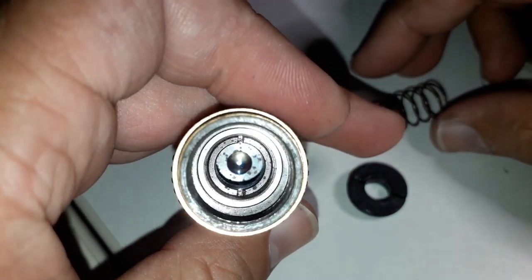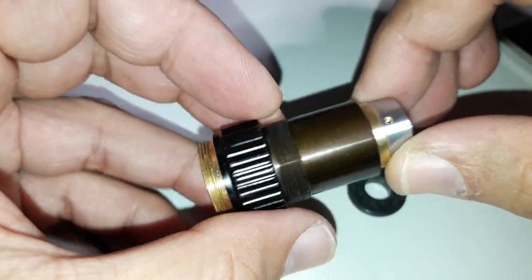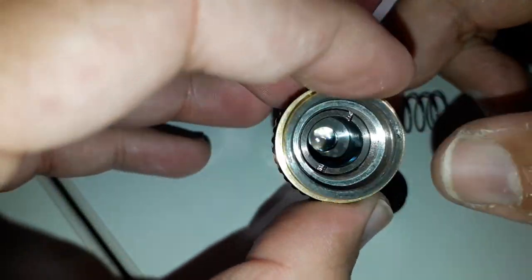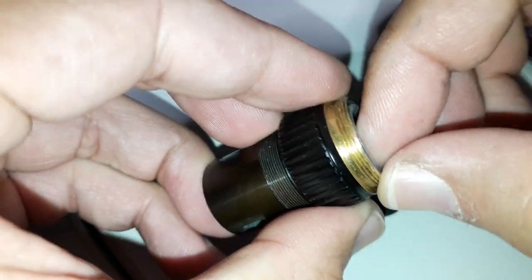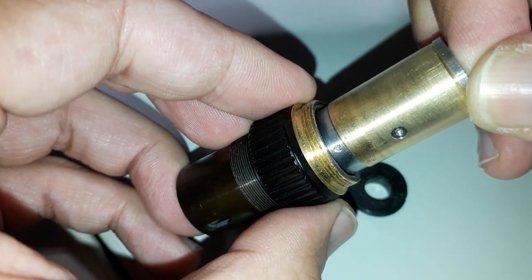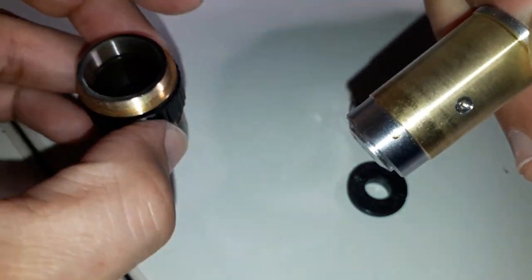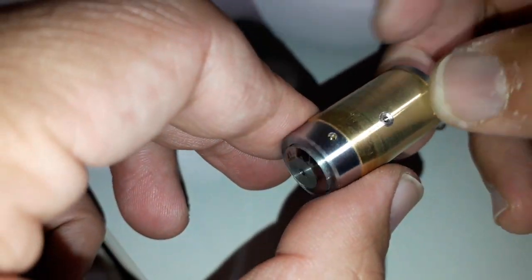Now that I have removed the spring, it was quite easy for me to remove the inside part. This is basically what I've done now. This is the inside barrel — carefully took it out. And this is basically how it looks like as we slowly work our way inwards.